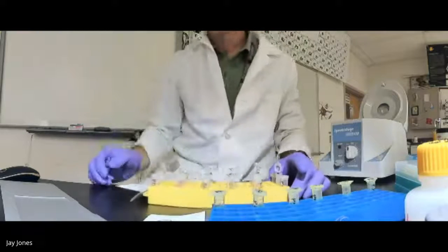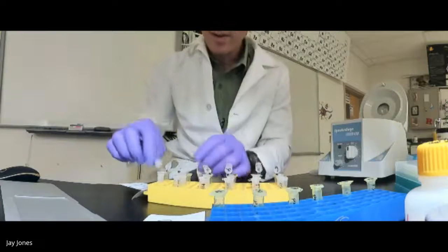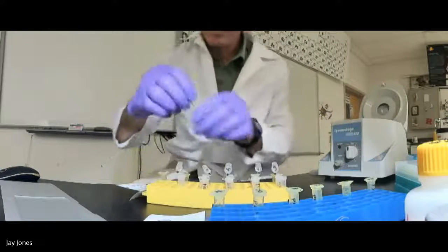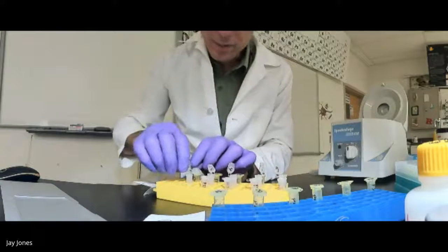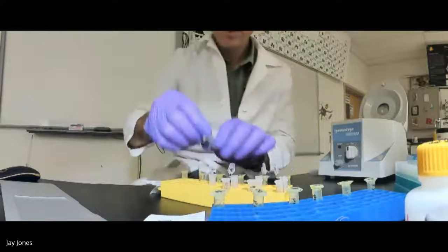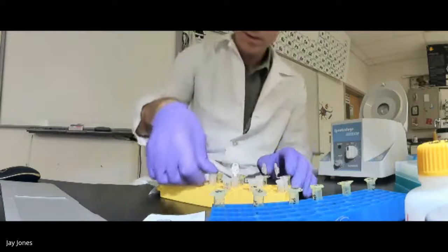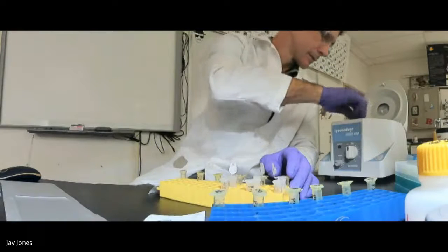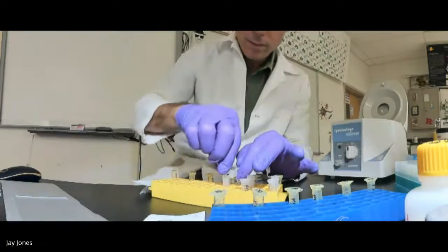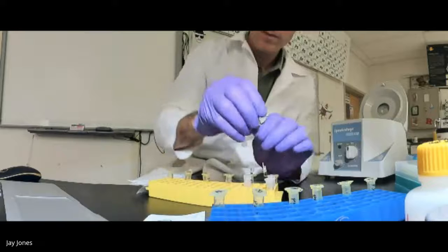All right, let me do period 12. Pouring the supernatant, not the white precipitate. I make sure that the numbers match, of course. This is T3, P12. T5.